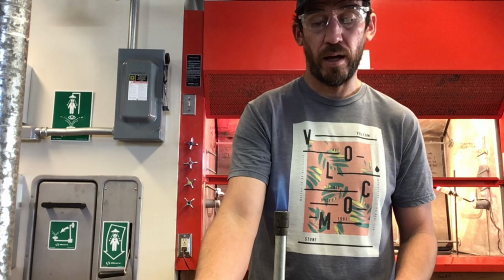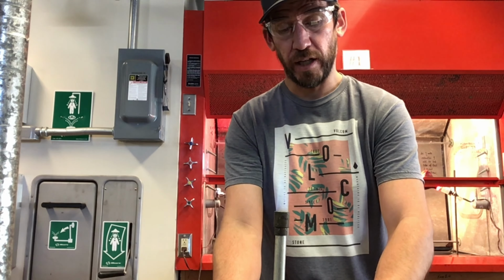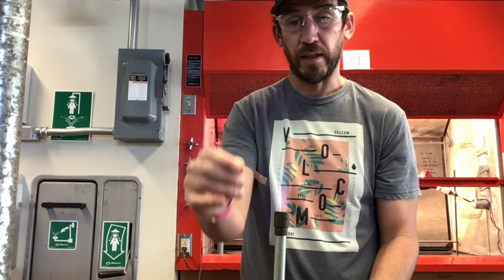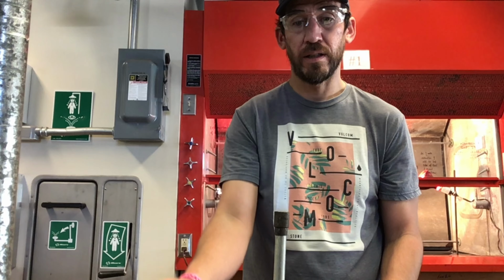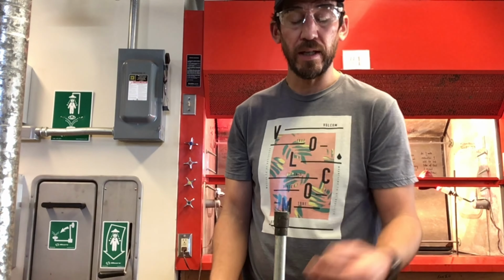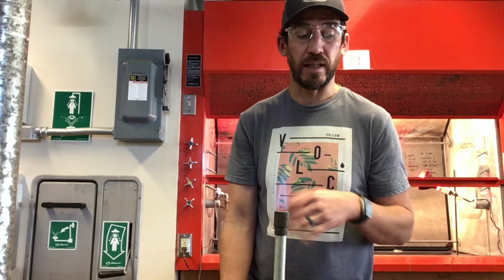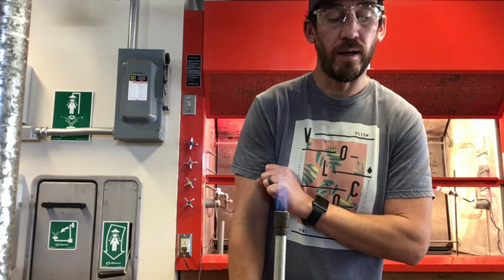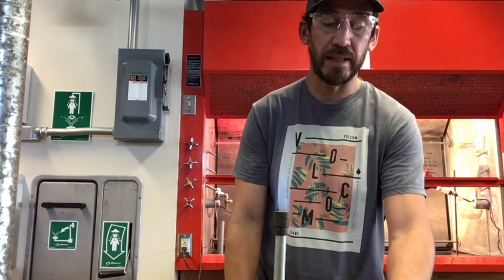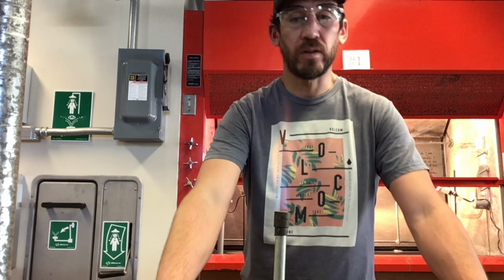So you always want to double check that, throw on some more stuff, and see if you can get the same results. Well, that time we didn't really see any green, so to me, most likely that means that there's no halogen in this solid material, but most definitely in the liquid material.